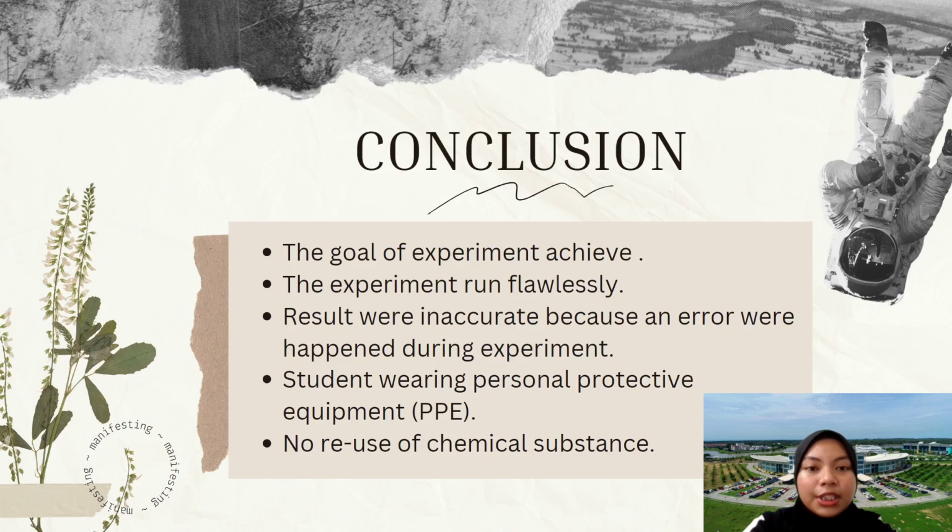Lastly, for precaution, students should be more careful by wearing full personal protective equipment, or PPE, during any experiment in a chemical laboratory to avoid direct inhalation of chemicals. No reuse of the chemical substance, and it should be thrown into the blue bin after the experiment is done.